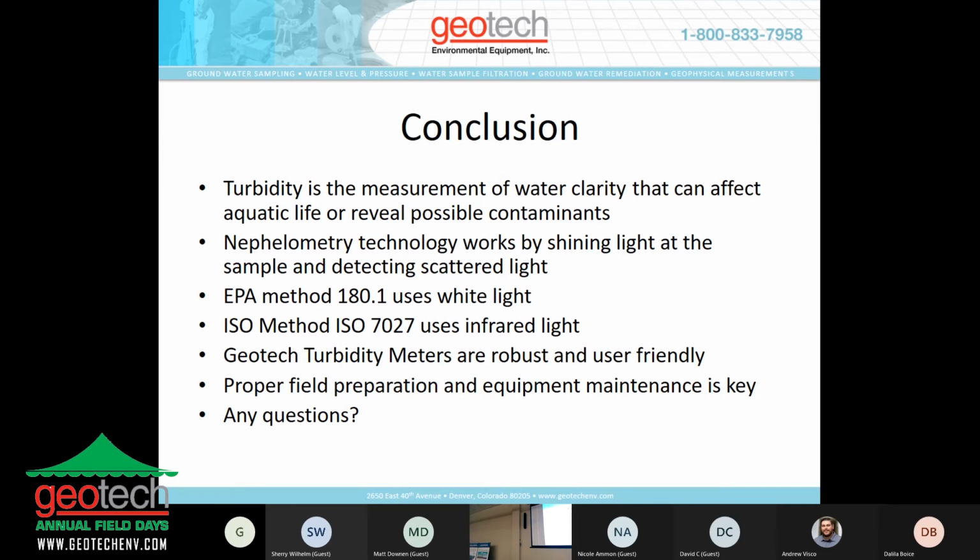As far as internal cleaning goes, for vials, just Alconox, or is there anything to avoid residues or anything like that? Alconox I think would be fine. I think the consideration I'd have is more making sure that everything's dried properly, and make sure that you're not smudging anything. So just using a lint-free cloth and making sure that you get any water droplets that are sitting at the bottom would be fine. But just a normal low phosphate-free cleaner should be fine.